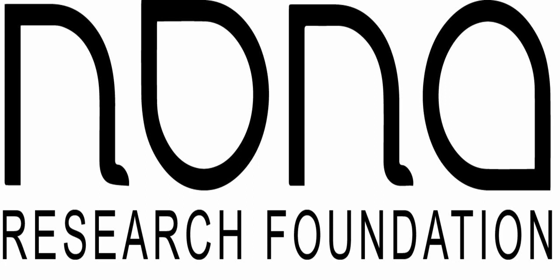I've seen quite a few, from Vika to GNU LIMS out there, and quite a few others like Aquarium. The thought is that they don't scale, as you said, where that scaling part is where sometimes it's an engineer with some big bucks out there that figures out how to make it scale, but hopefully we can find somebody out there in the open source to help out.